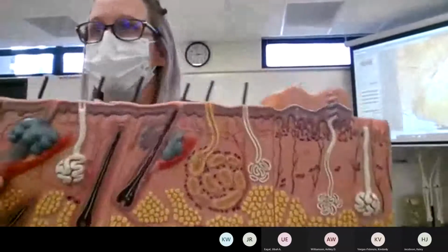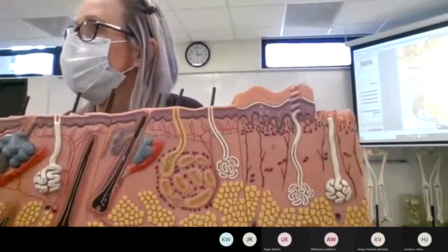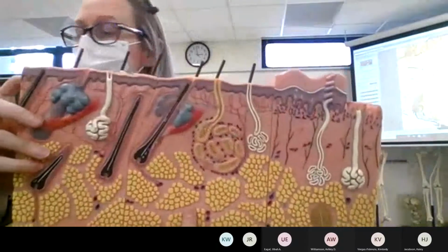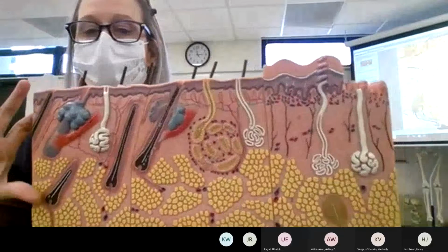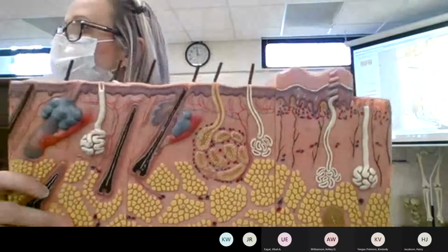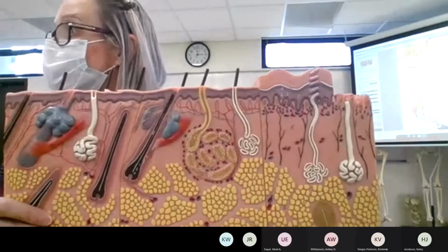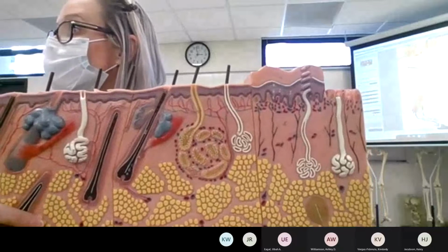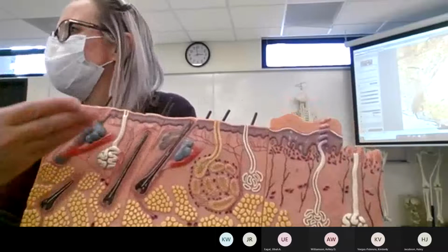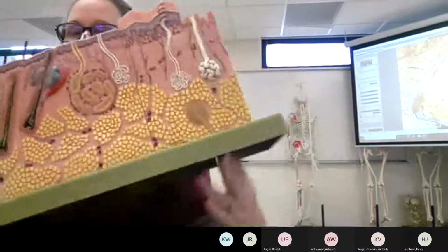so just like the picture from chapter 5, this picture and this model go really well together. So you have epidermis, then you have dermis, and where the dermis ends and the hypodermis begins, it's an imaginary line. The big thing that we know is going to be in the hypodermis is a lot of adipocytes. And we tend to think that the hair bulbs and roots tend to be more in the dermis. So you kind of have an imaginary line.